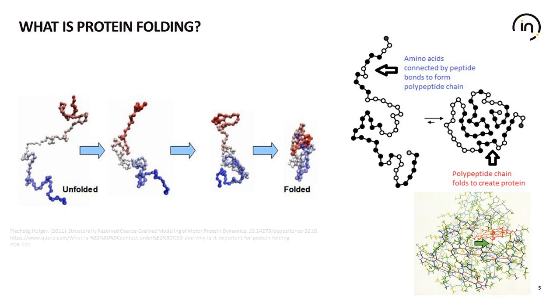Having discussed this, I'll be coming back to it later, but we will briefly discuss the manufacturing process of a biopharmaceutical product, where a protein is in a stressful environment during the different stages of production. This dynamic protein structure becomes very susceptible to unnatural structural changes and can actually misfold.